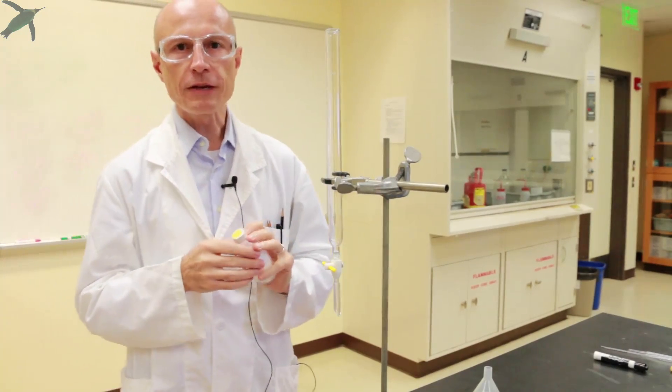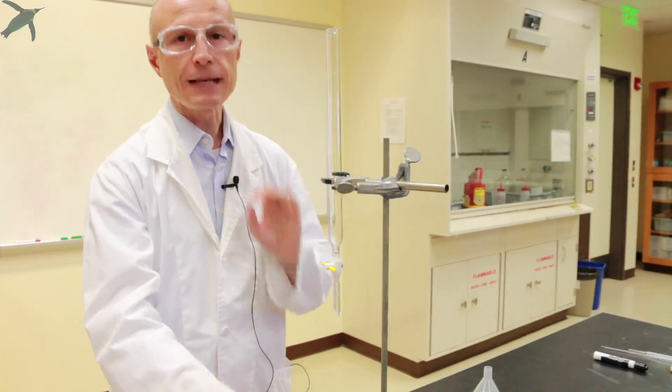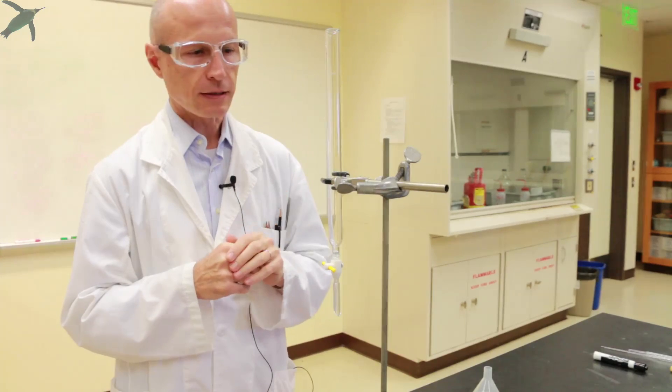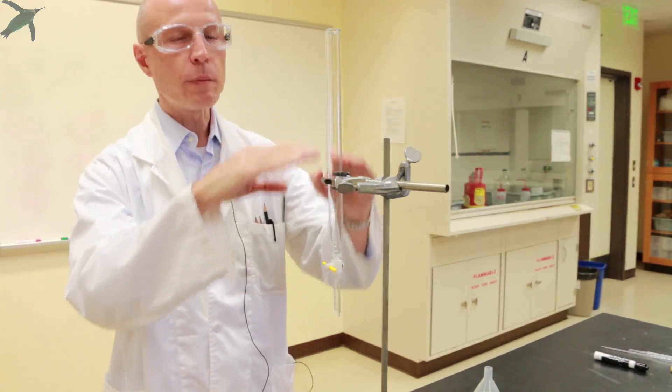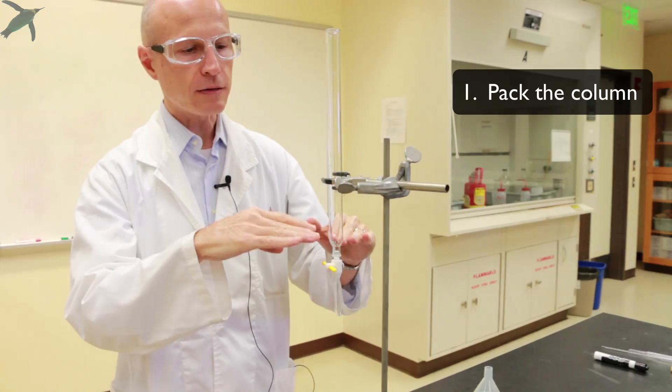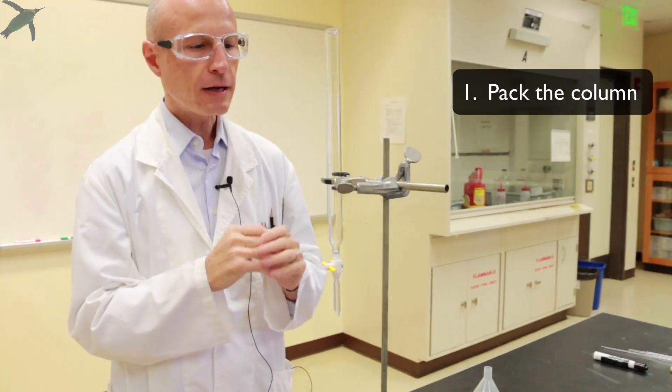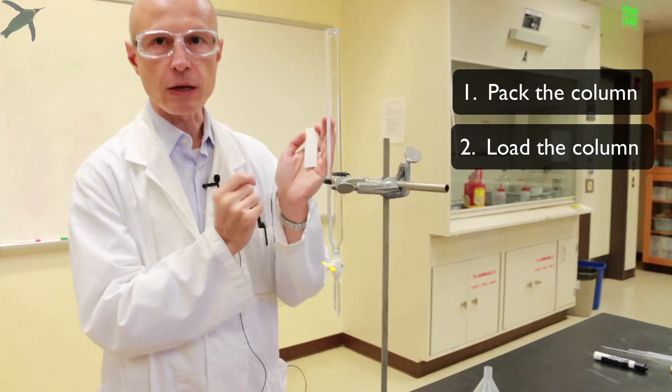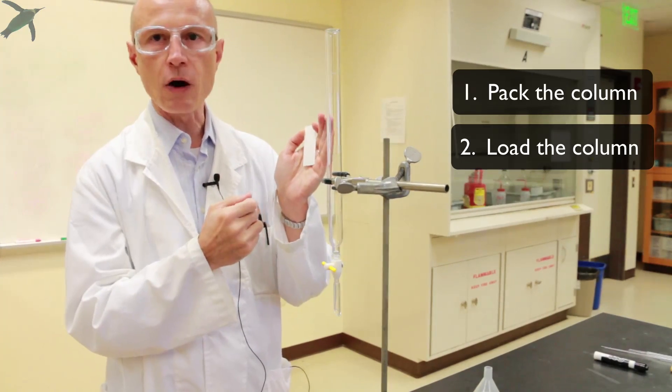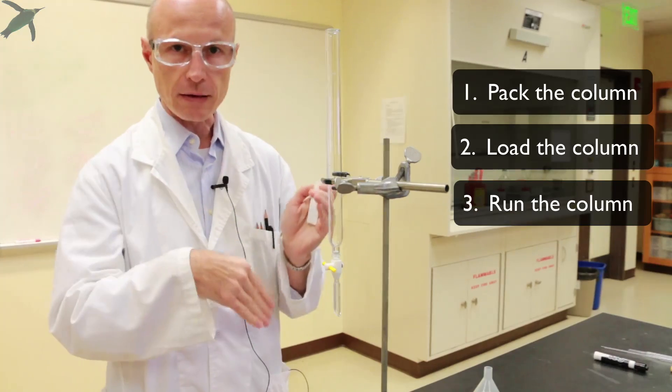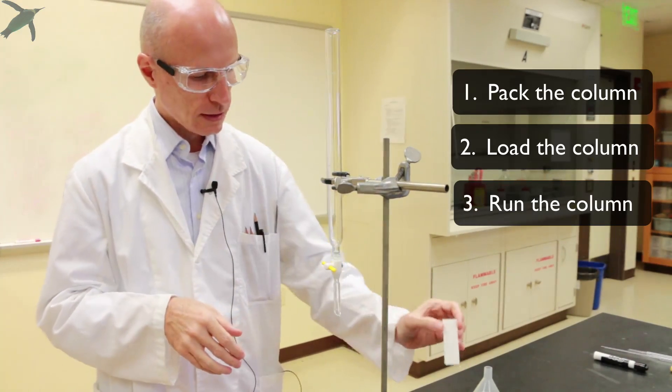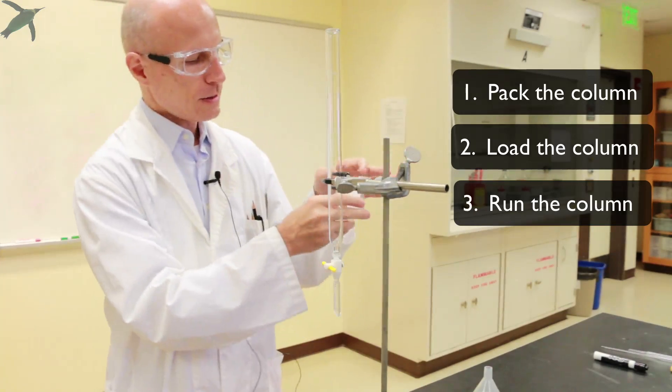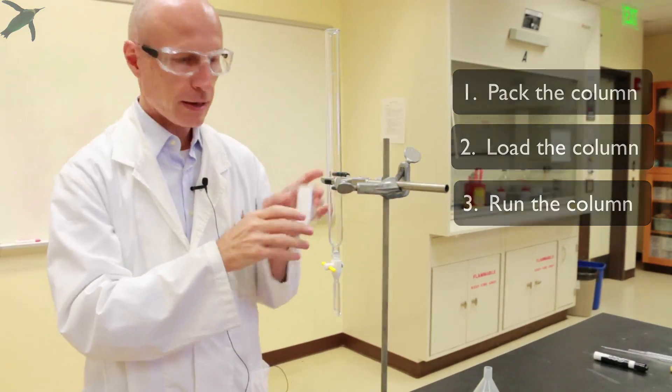Column chromatography is a very touchy technique. There are three phases in column chromatography. First you pack the column, that is you prepare it for your experiment. Then you load it, which is the equivalent of spotting the TLC plate, that is you put your compound on the silica gel. And then you run it, which is the equivalent of putting your TLC plate in the TLC chamber and running it up.